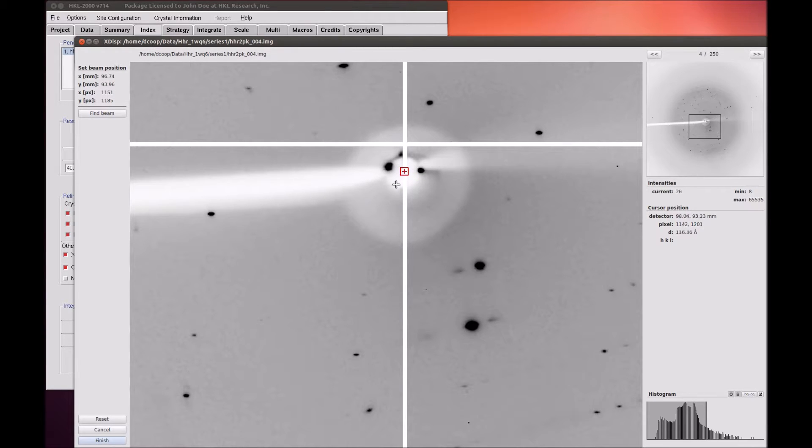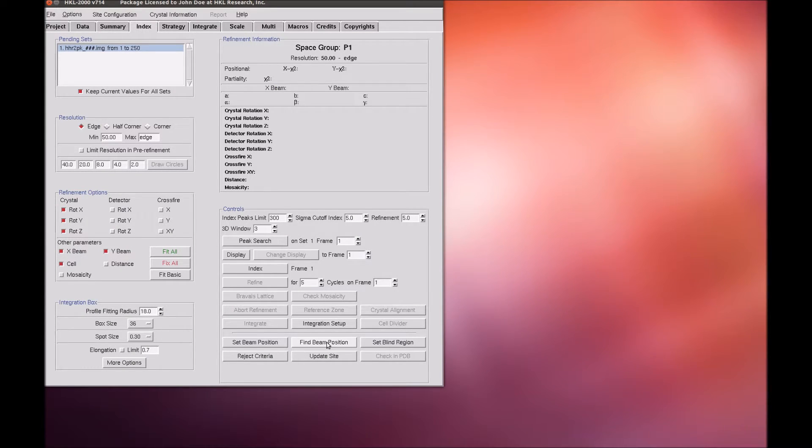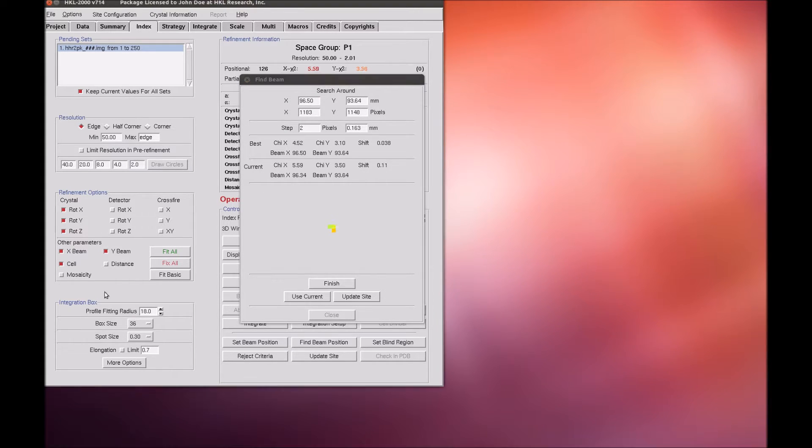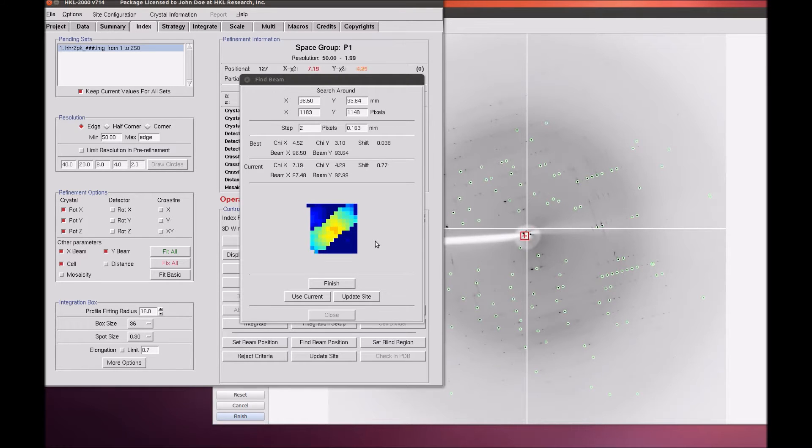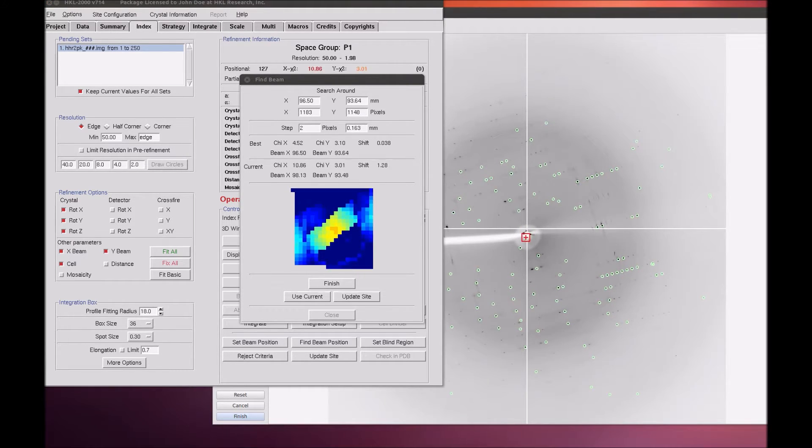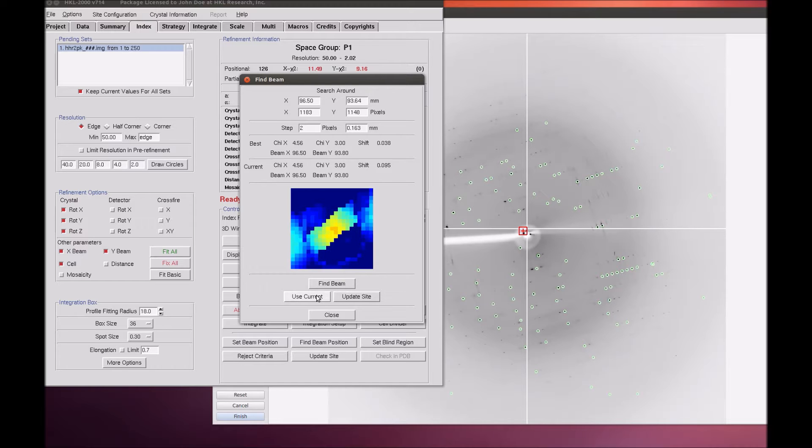If you are really having trouble locating the beam center, perform a peak search and then use the Find Beam Position button in the Index tab of the main HKL window, which is shown here speeded up. This function will try to find the beam center by trying to index the image using different values for the beam center. When it has finished rastering around, the hottest pixel will automatically be selected. Or, you can select a pixel, then click Use Current. You can optionally update the site.